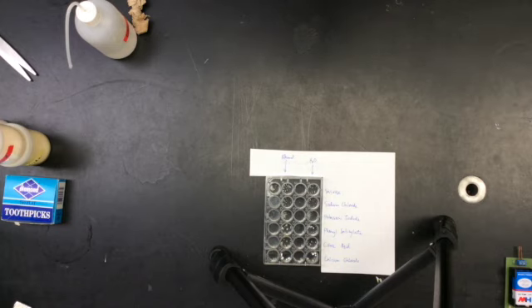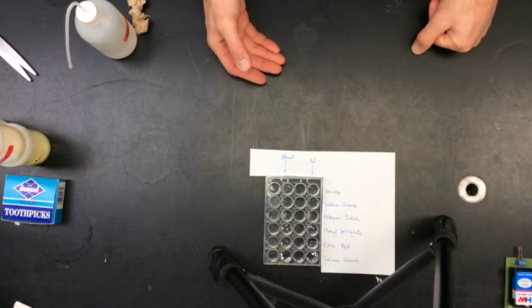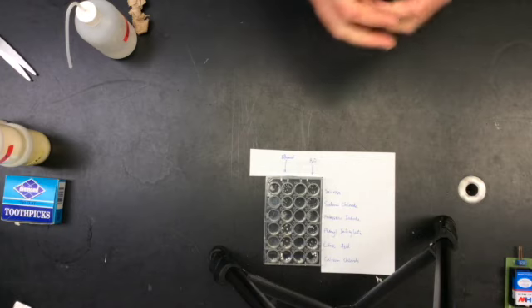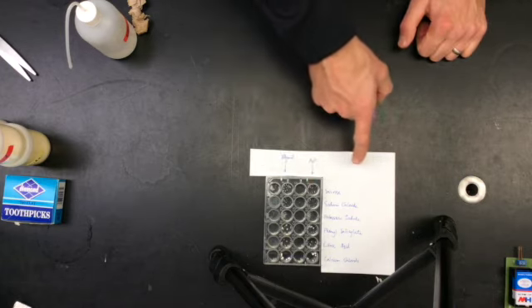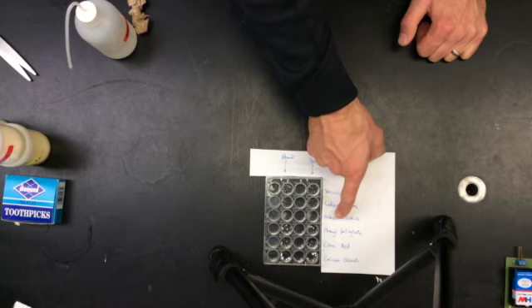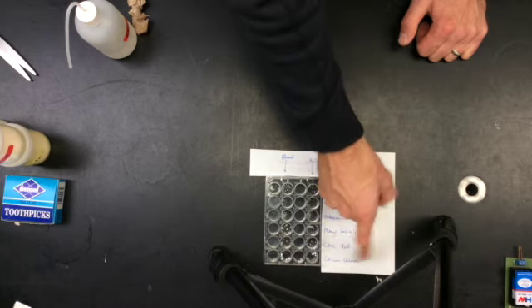All right, guys, this is the solubility and conductivity portion of our experiment. Let's run through our setup. So in this portion of the experiment, we're going to be using a well plate. That's this device right here. The well plates have individual containers, and in each of these containers, I've placed a small amount of our 6 compounds: sucrose, sodium chloride, potassium iodide, phenyl salicylate, citric acid, and calcium chloride.